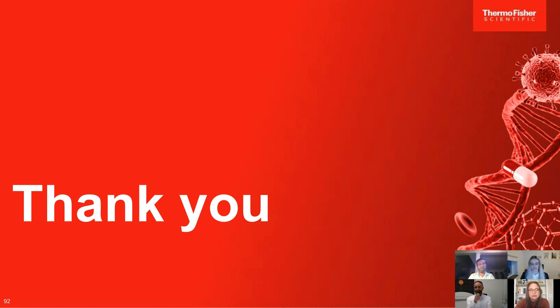It was quite difficult to find good areas on the grid, and I also collected it on a microscope without the energy filter or cold FEG. I'm planning to do a little bit of grid optimization and use a better technology and see if I can improve the resolution.